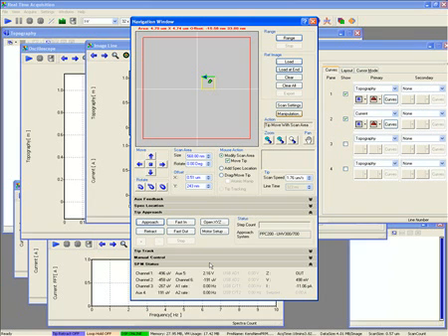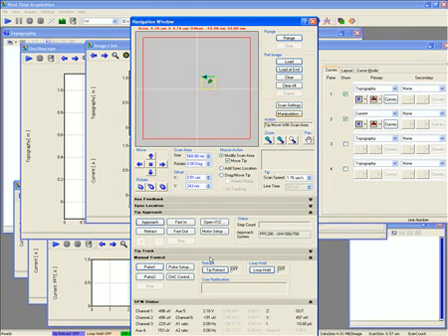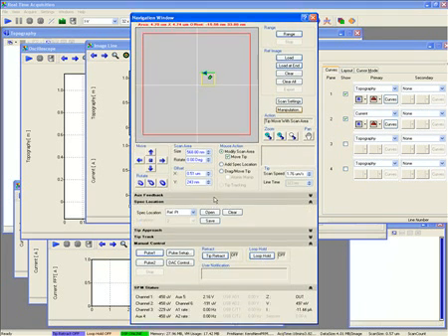Other tabs of the navigation window, we have the manual control, which can handle tip retracting and freezing the feedback loop. These can now be done during acquisition. The spectroscopy controls can also be found on the navigation window. The aux feedback can also be found on the navigation window.